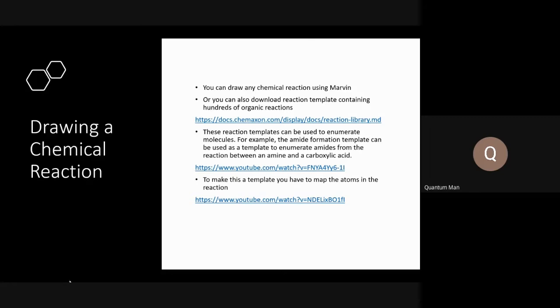Some compounds don't even exist. But you can generate them, and maybe you can get students to do synthesis. Up to you. Organic chemists will know more about this.